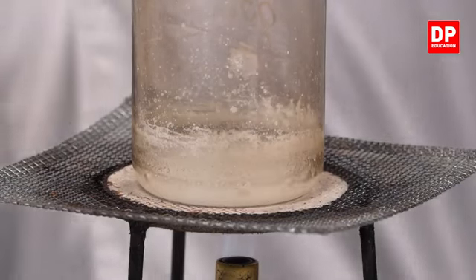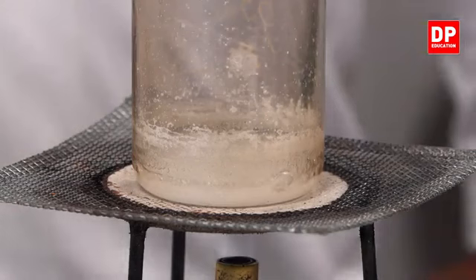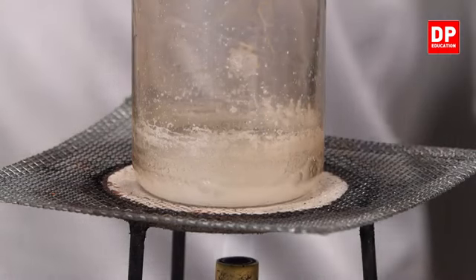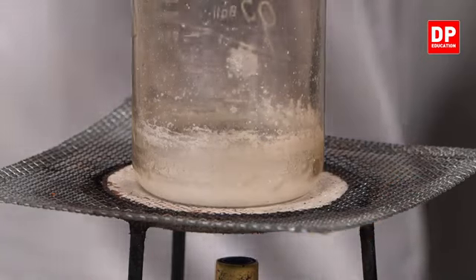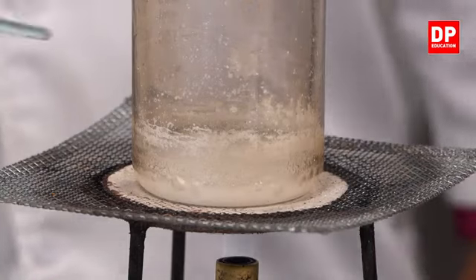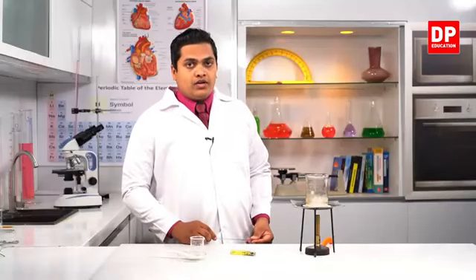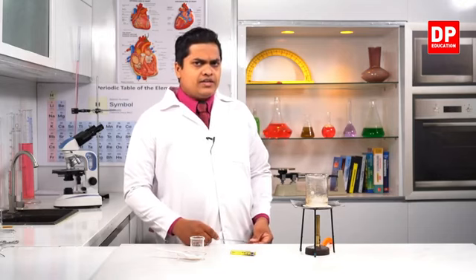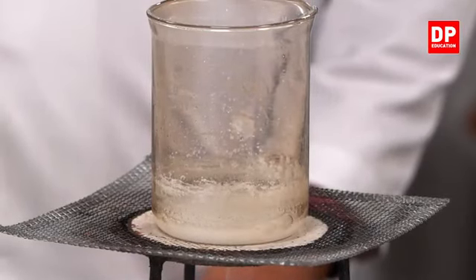Right, my dear children, now we are at the final stage. Now almost all the water has been evaporated. Now we can clearly observe the white powder around the beaker. Right? See, if you check the wall of the beaker, you can clearly observe that white color powder. That white color powder is the salt that we dissolved in the earlier stage, right?